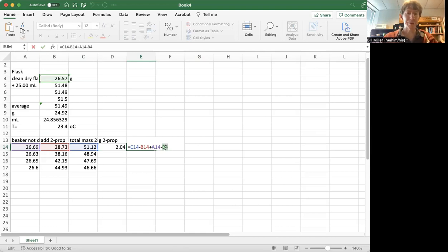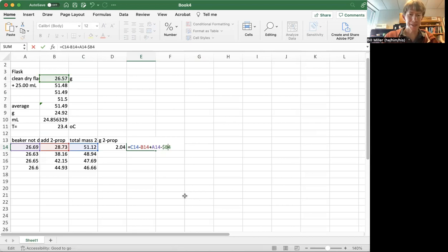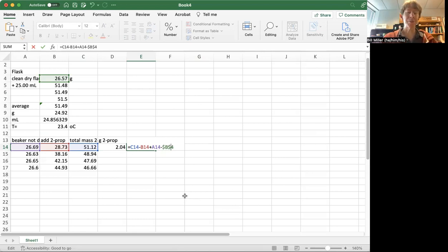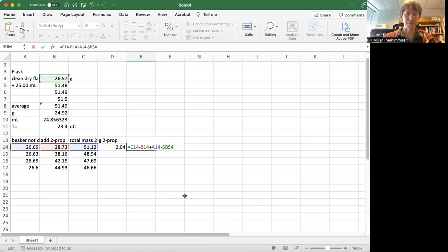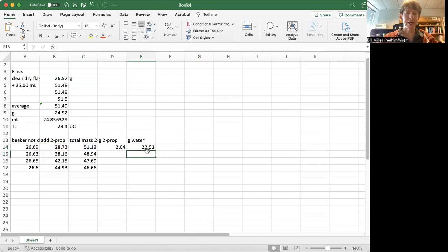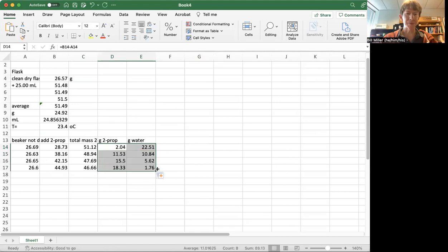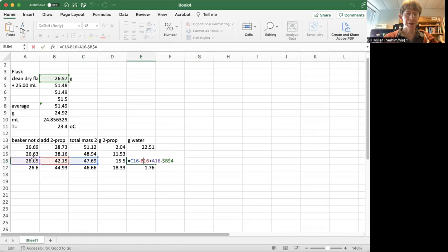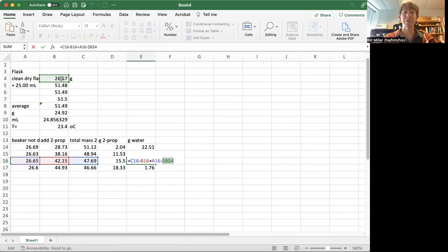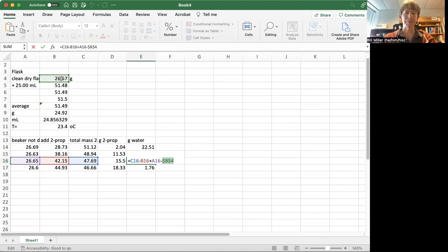So what I'm going to do is I'm going to actually put dollar signs in here. Dollar signs in Microsoft Excel tell the computer that as I move down the rows, because what I'm going to do is I'm going to highlight both of these, I'm going to click and drag. And you can see that this one, for example, references the three cells here. But because I have these dollar signs in here, it's actually still referencing the clean dry flask. So that's a way of keeping a reference to a cell, even as you go down the different rows.